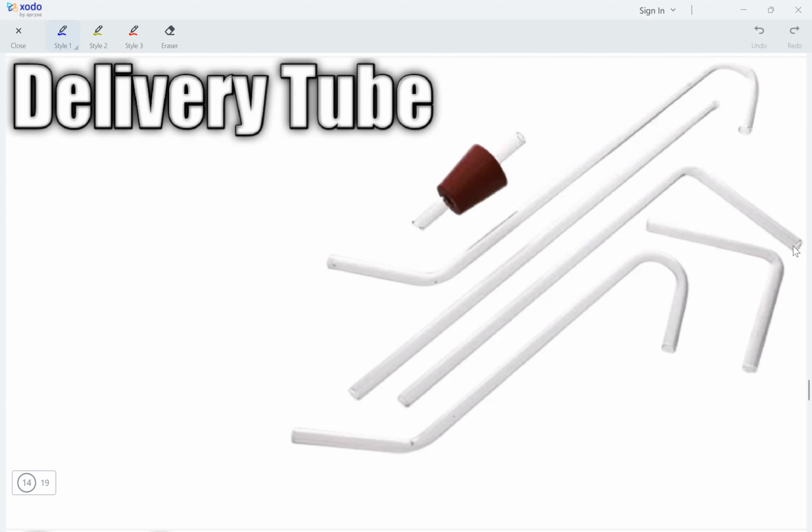So we place a delivery tube with a rubber bung on the boiling tube and we place the other end of the delivery tube in another test tube or boiling tube in which we place lime water. And as the gas is produced and is passed through lime water, the calcium hydroxide will react with carbon dioxide to form calcium carbonate, which would turn the lime water milky. So in this way, a delivery tube can be used to deliver a gas from one container into another container, usually in order to test for the said gas.